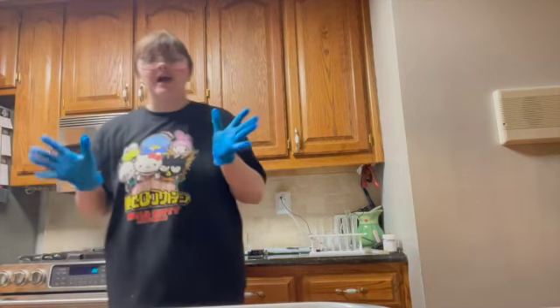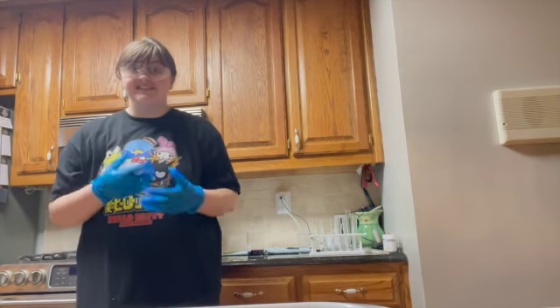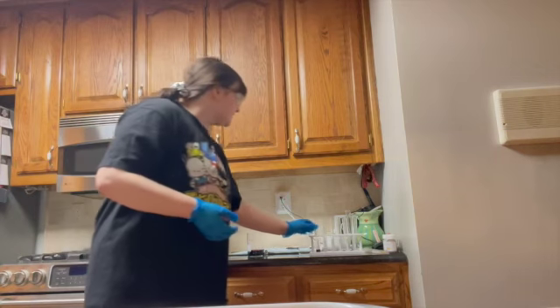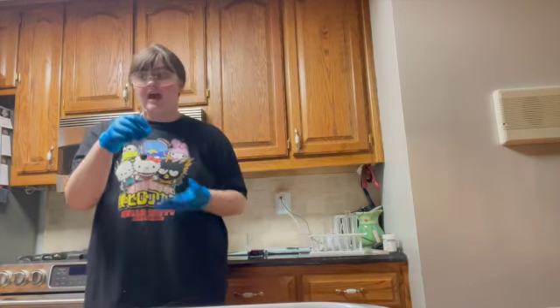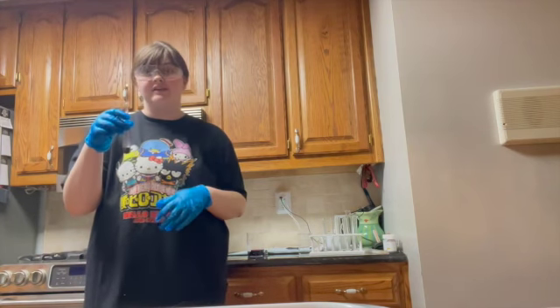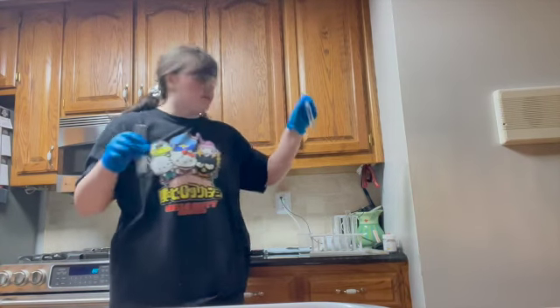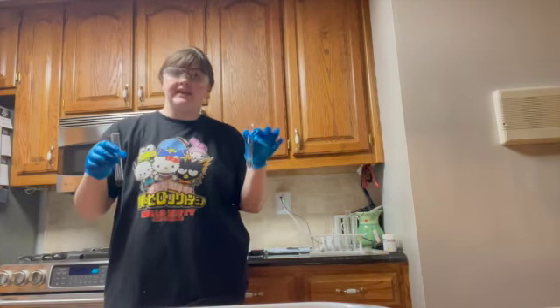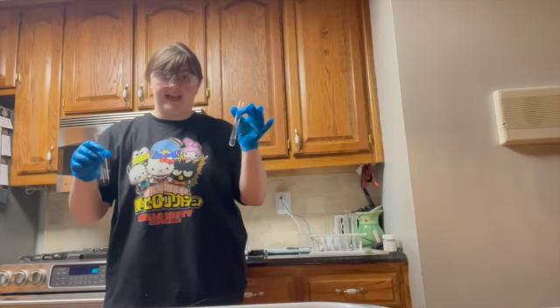Hello, we're about to start reaction 1 for this kinetics lab, and as you can see, I already measured out 4 milliliters of my 0.03 molarity potassium permanganate and also 4 milliliters of the 0.6 molarity oxalic acid.